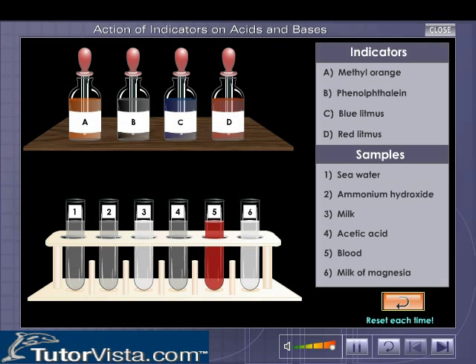Now click on the reset button. This is important. Now drag the dropper from the methyl orange into test tube 2 and observe the change again. Repeat the steps by dropping methyl orange into test tubes 3, 4, 5 and 6. Remember to reset each time.